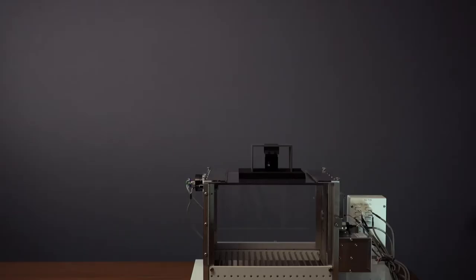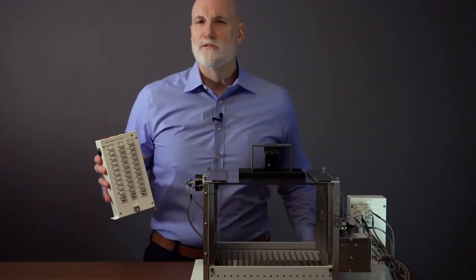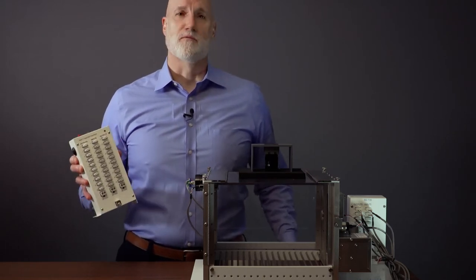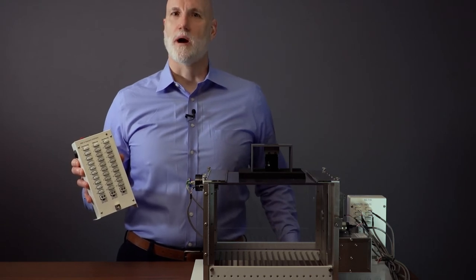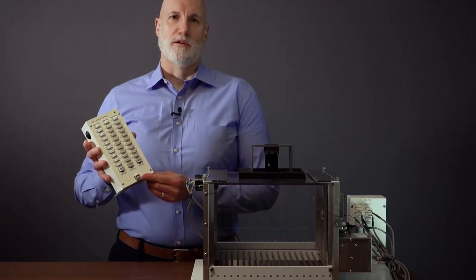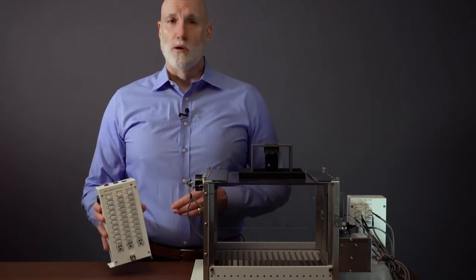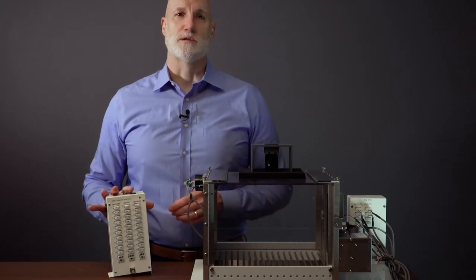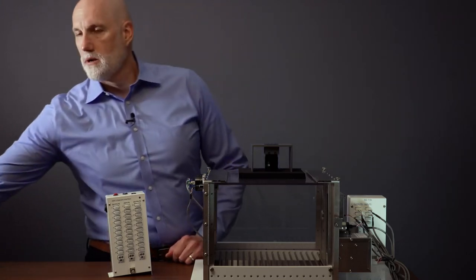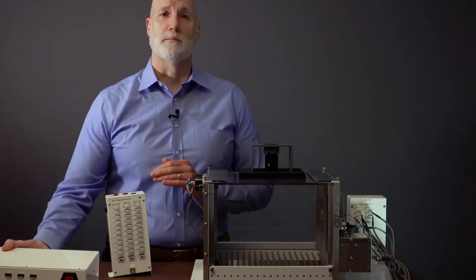Great. As Flavia just said, we'll start by taking a look at that interface. And here it is. For those of you who have MedAssociates, you may find this to be quite familiar. This was designed to be a drop-in replacement for the existing MedAssociates box. One major difference is that the interface will connect directly to the computer via USB, no other cabling. However, while it is connected via USB, it's not powered through the USB. For that, you'll need either a simple power brick, or you could use the operant USB hub that we have, which will allow you to connect up to 4 boxes.